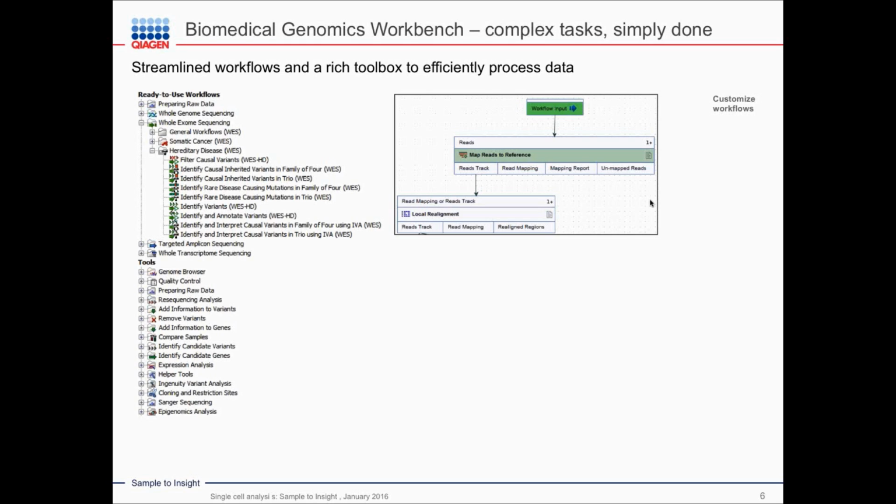For instance, if one is using PCR-based technology, which would be the alternative to REPLI-g, you would be first starting potentially with a degenerate oligonucleotide, or perhaps you would be using a primer extension for preamplification, and these would all be methods that you would use to get more DNA for doing your downstream next-gen sequencing.